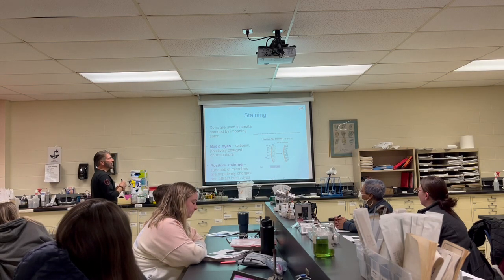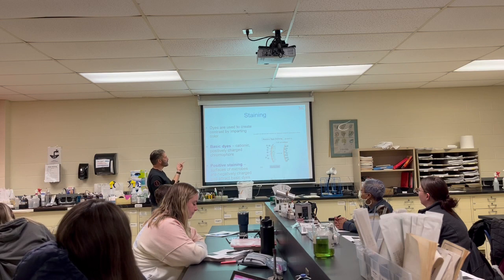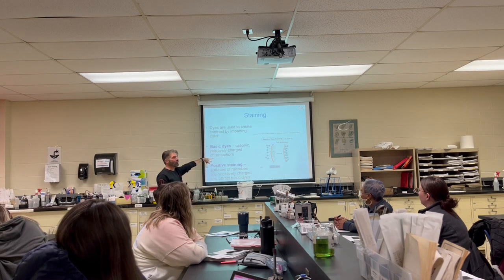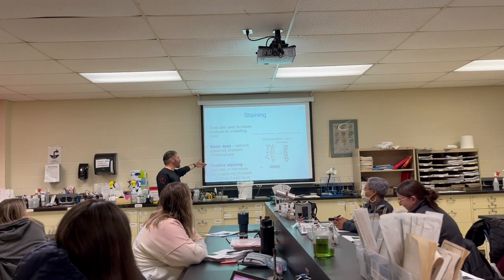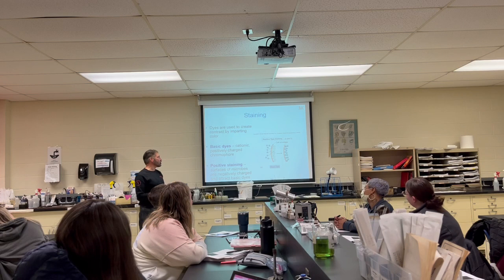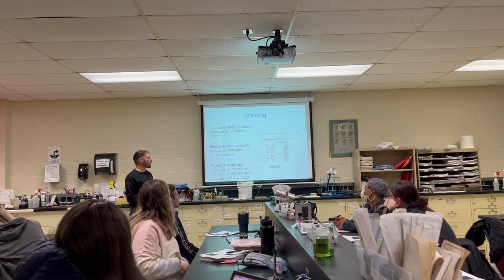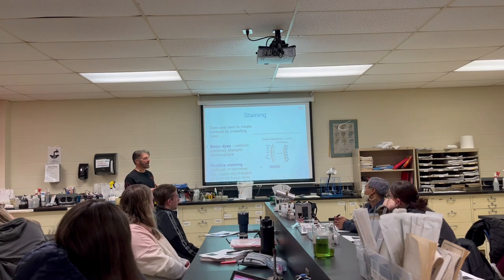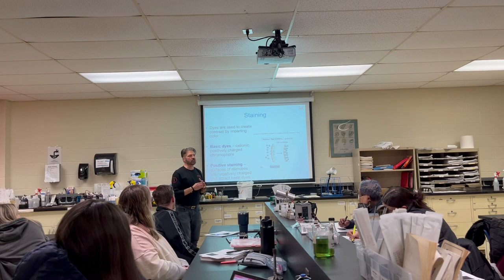So basic dyes are cationic. Is that positive charge or negative charge? Positive. Positively charged. All right, so positive staining: surfaces of microbes are negatively charged and they attract basic dyes. So we're doing some basic dyes, and if it works, we're doing some special stains.